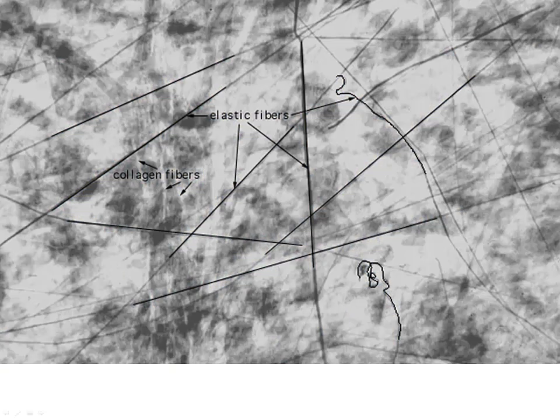And if you can sort of imagine and change your focus, so behind the elastic fibers, out of the plane of section somewhat, these much larger diametered fibers that we see running in parallel right here, these are going to be our collagen fibers. So we have fibrous components, elastic, collagen, a lot of space, cells scattered throughout here. This would be our loose or areolar connective tissue.